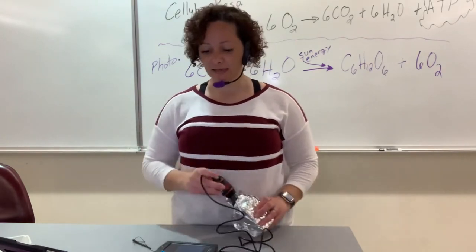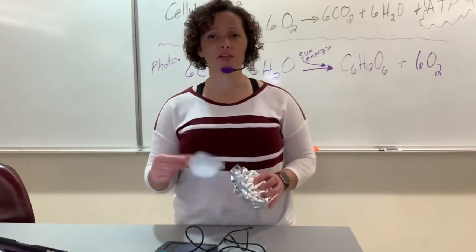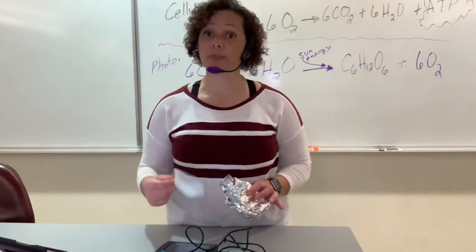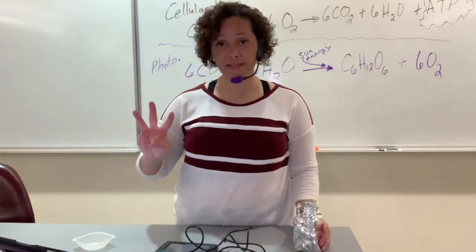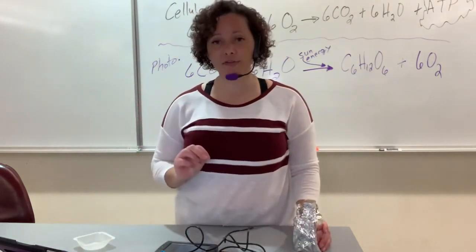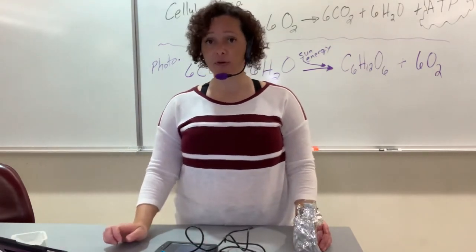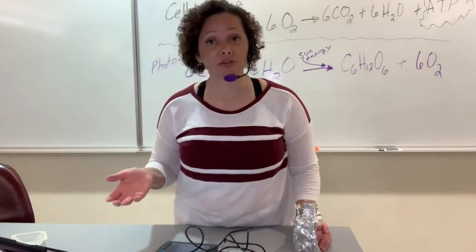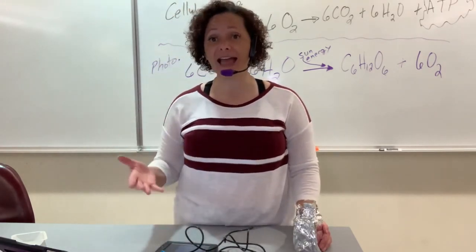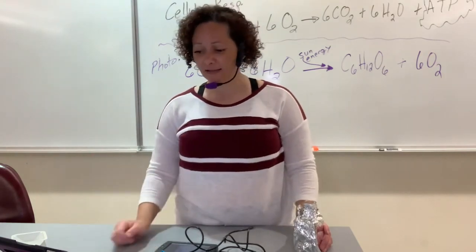Then, while it's sitting and waiting, and you're doing your writing, your group members are giving your organism some oxygen, especially if they're animals, okay? And then you do it a 3rd time. After the 3rd time, you can go ahead and take the average of those 3. You might find that your slope is going negative. Don't worry about it. You're going to figure out the average slope for all 3 trials, and you're going to put that in the last column.